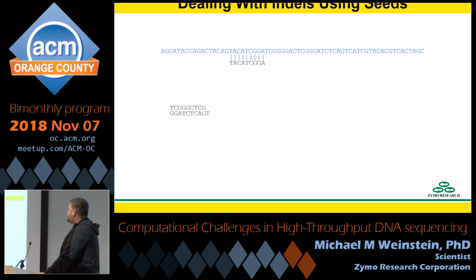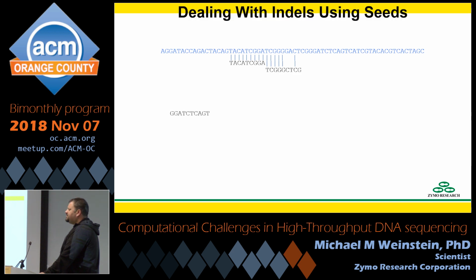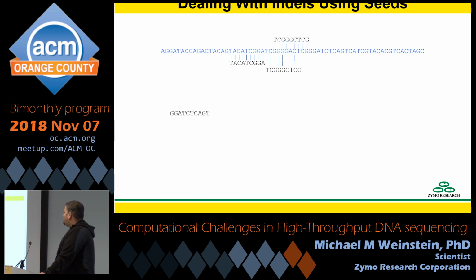So aligning the first seed, I find a perfect match here. Aligning the second seed doesn't really match where it's supposed to go. And we know this is prior information, but you really wouldn't know this in a sequencing experiment. It matches kind of okay here. It matches equally well over here. So we don't really know where this thing goes. Taking the next one, matches perfectly there. Doesn't match nearly as well anywhere else. So now we can kind of see how this would go. And then at that point, you can do a local alignment and figure out how these things really belong, and ultimately figure out that you have a 2-base deletion in the middle.